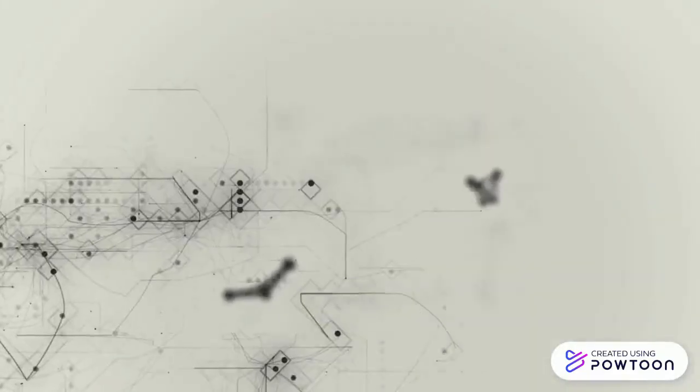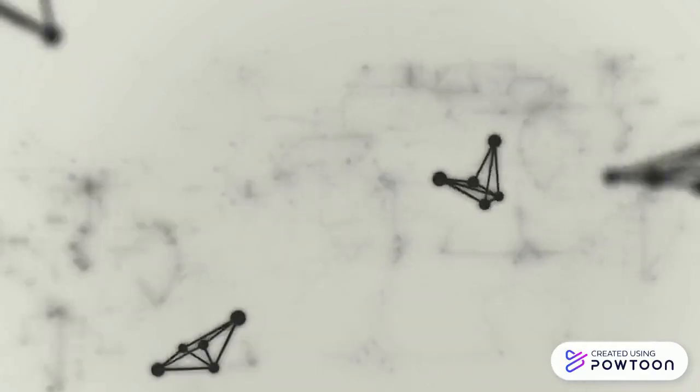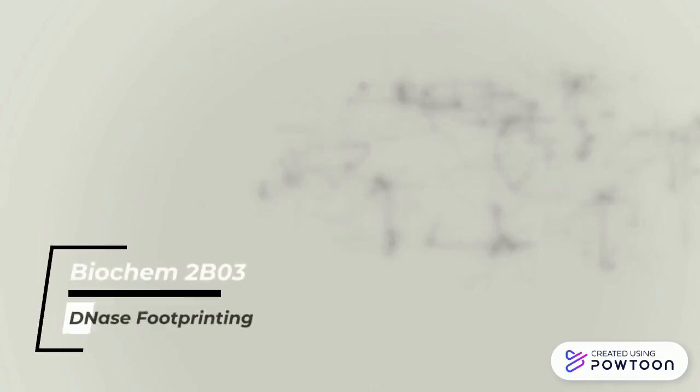Though a fairly simple example of footprinting, discovering the specificity of a protein from the use of simple, fundamental research techniques holds great power. From this point on, the role of the protein study can be further hypothesized, whether a repressor, inducer, transcription factor, or many others. Ultimately, the importance of DNase footprinting is clear. With a relatively inexpensive and simple methodology that can study the ever-important interactions of DNA and proteins, its uses in the field are truly endless.